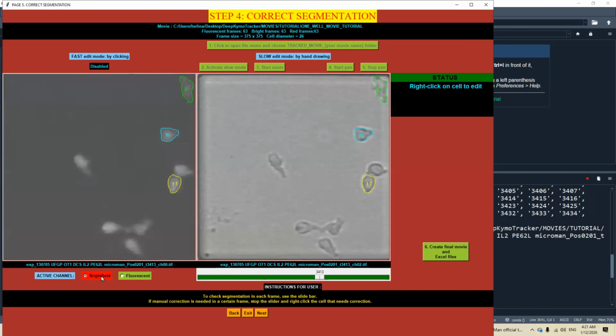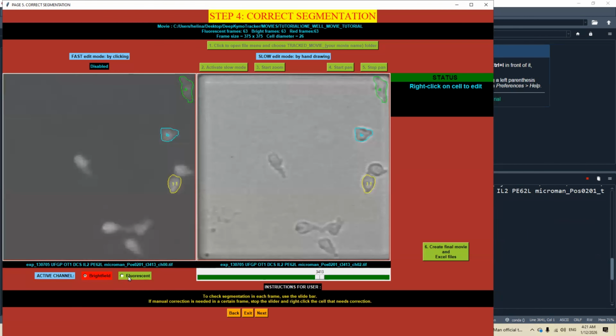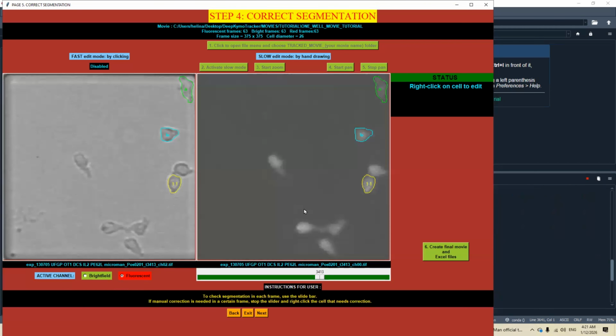The nice thing about this is that you can switch from one channel to another as many times as you wish, and any moment you like during the process of manual correction. The only exception is the pen stage, but you don't have to worry about it as these buttons will be disabled at this stage anyway.